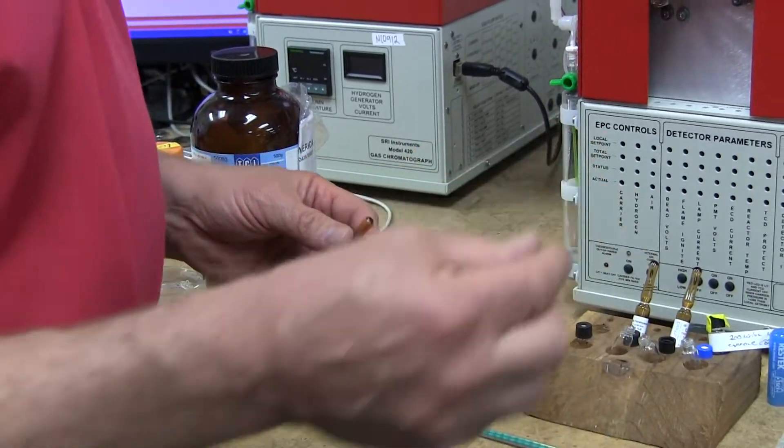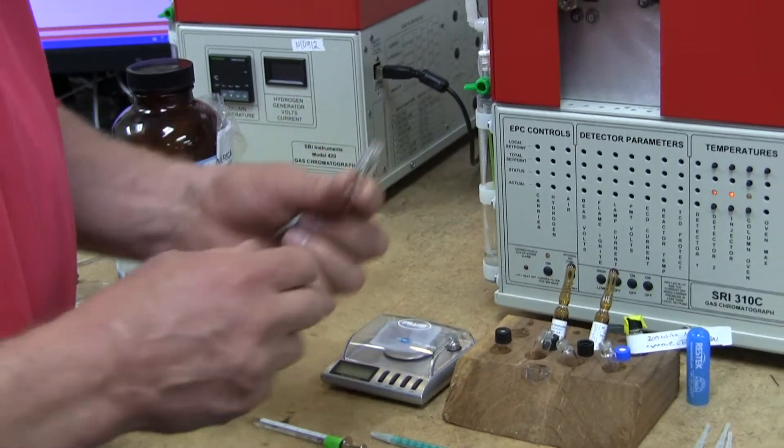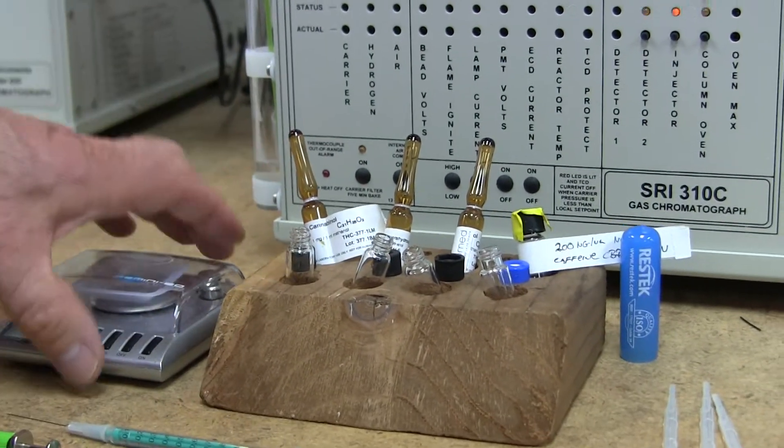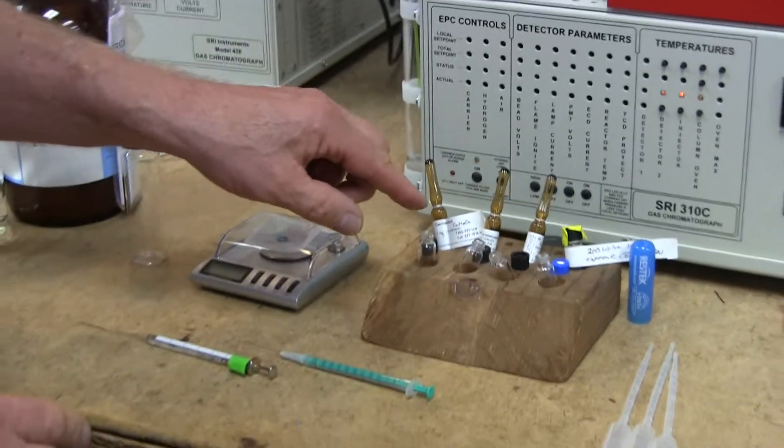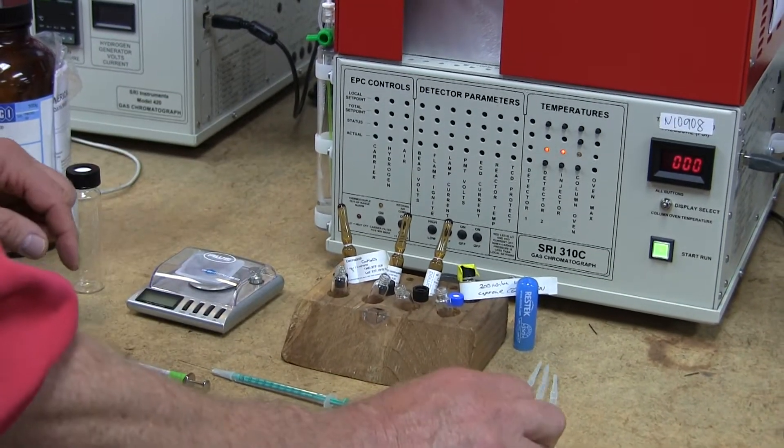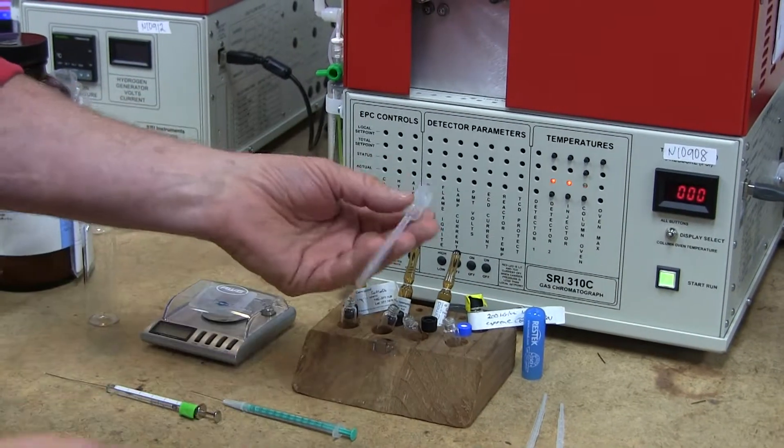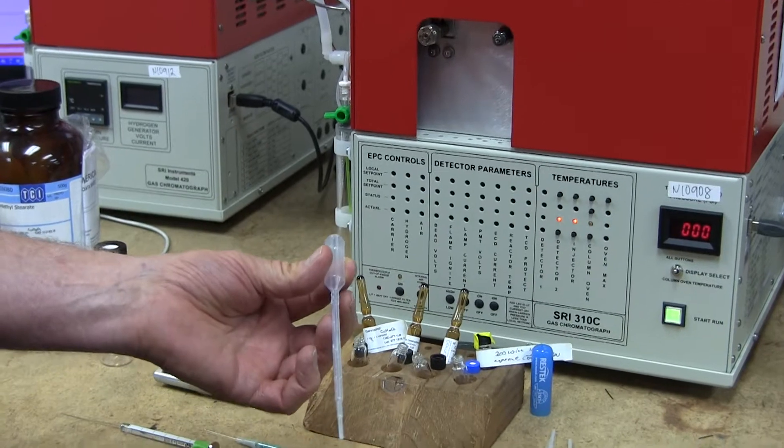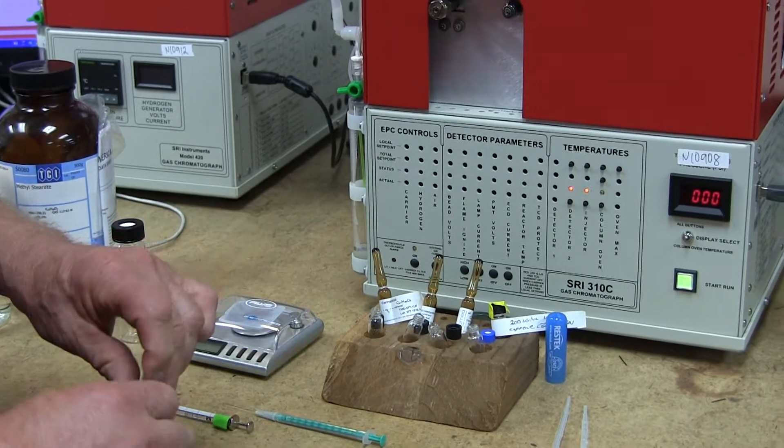So, we have to get the sample, the standard rather, out of this glass ampule and into that little bottle. So when you buy a GC from us, we give you these little disposable plastic pipettes. If not, they're very cheap, they're three or four cents each, you buy a box of a thousand.